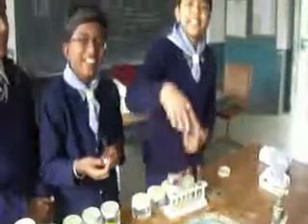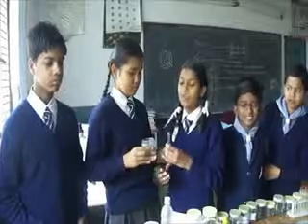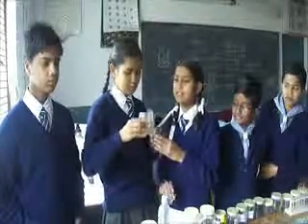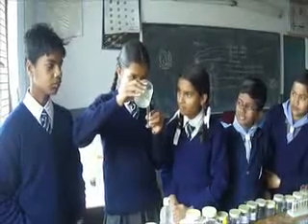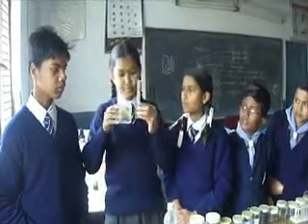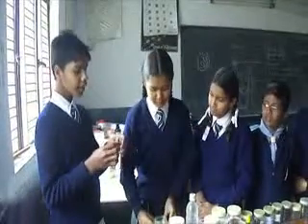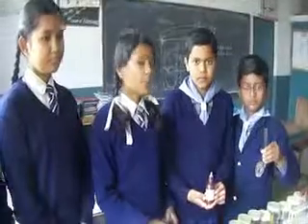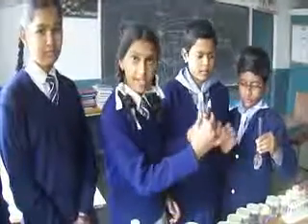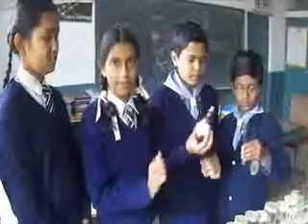Shake it to remove the residue. Measure 4 ml of water sample with the help of this measuring cylinder. Transfer this 4 ml of water into another test tube. Put 15 drops of fluoride reagent in the test tube which contains the water sample.